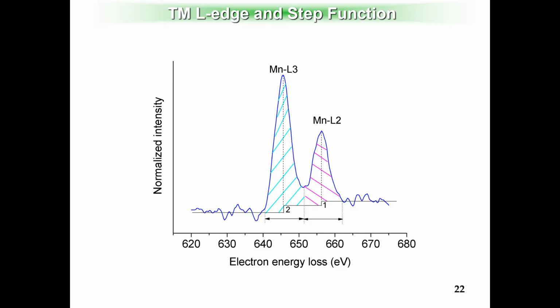Yes, yes. The reason I don't prefer that method is because you always need to consider the energy resolution of the technique. For XAS and XPS, the energy resolution can be down to, I believe, 10 milli electron volts. At that level, the shifting makes sense to me, because a lot of times, even when there is an oxidation state change, your shifting of the peaks is well within, say, 0.1 electron volt.